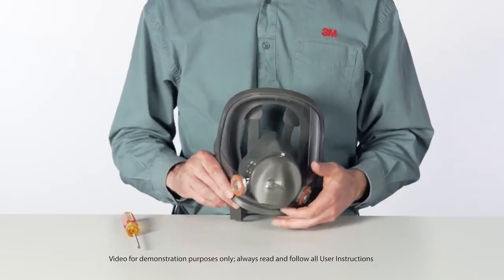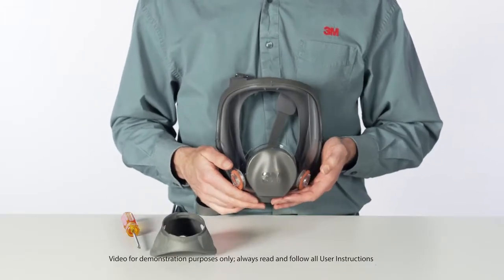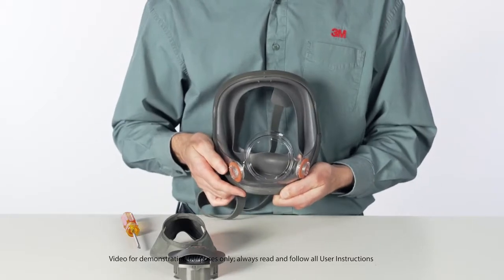Remove the nose cup assembly from inside the facepiece by turning it counterclockwise one-quarter turn and withdrawing it from the lens center port. Remove the two Phillips screws from the frame.